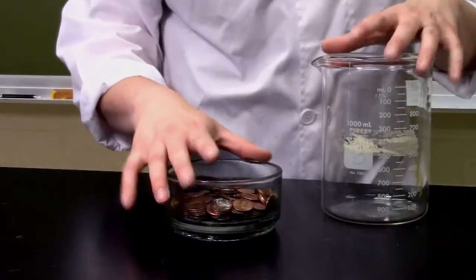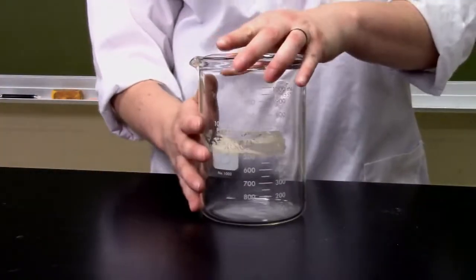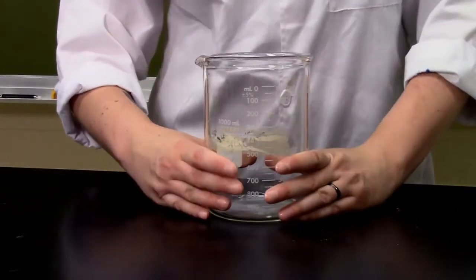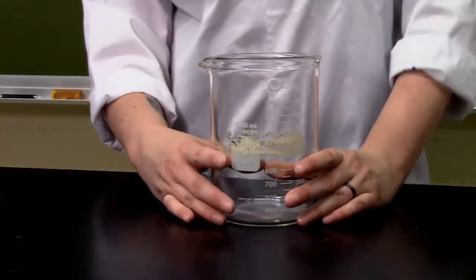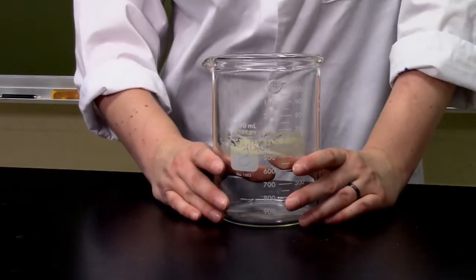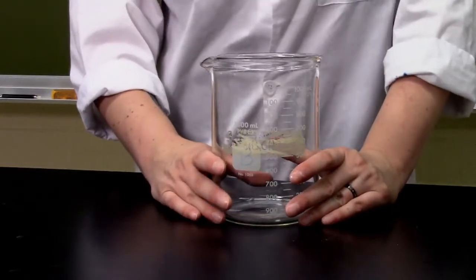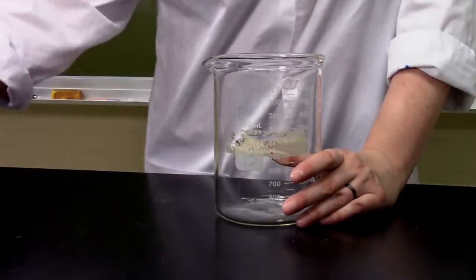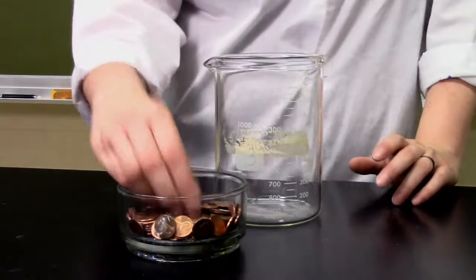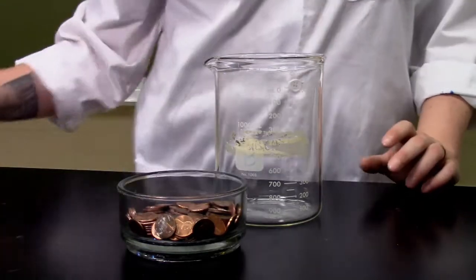First up, we need to clean our pennies. So I have all the pennies in this container, and what I'm going to do is fill this 1,000 milliliter beaker, so 1 liter beaker, full of a solution of vinegar and table salt, NaCl, sodium chloride. I'm going to put this solution on a hot plate so that it gets nice and hot. I'm going to add the pennies, and that vinegar salt solution is going to clean off our pennies and turn them nice, bright, and shiny.